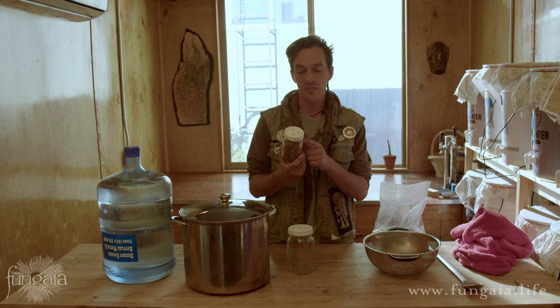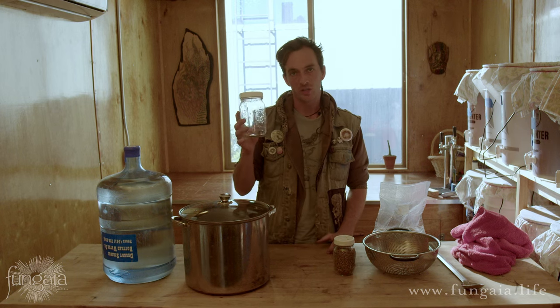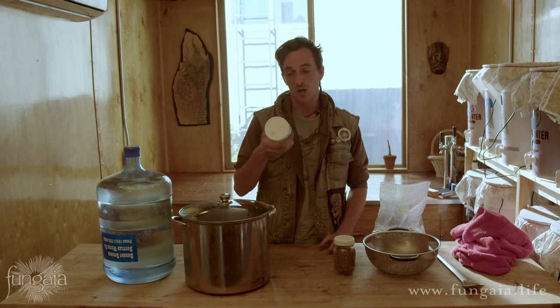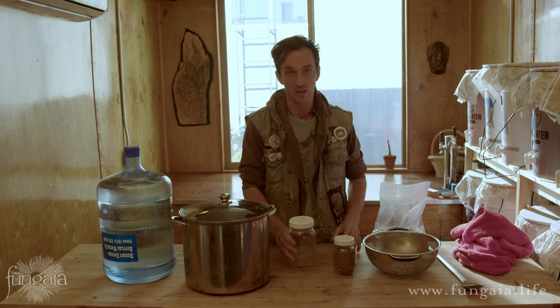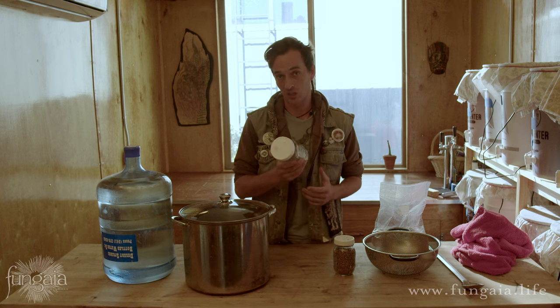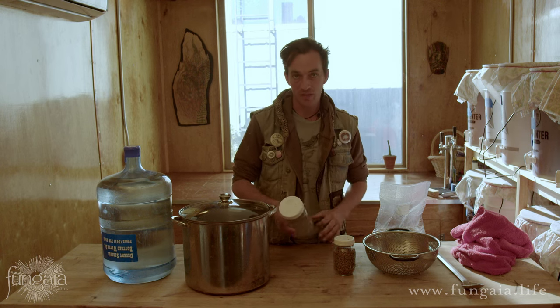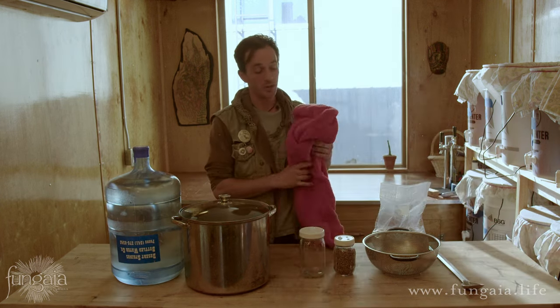Mason jars come in all shapes and sizes and it doesn't really matter what you go with. I personally enjoy working with regular mouth pint jars — you can fit a lot of those in a pressure cooker. The go-to is generally the one-quart wide mouth jar. A wide mouth makes it a lot easier to get the grain spawn out after incubation, since it can form a solid brick. The problem with wide mouth lids is they provide so much air exchange that the top layer of grain can actually dry out, so you've got to weigh the advantages and disadvantages. Just use what you have.